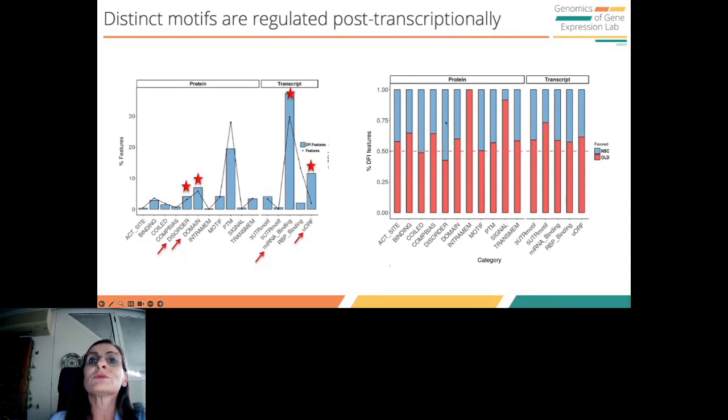And also what we can see is, if we evaluate the amount of functional content that we have as we transition from progenitor cells to oligodendrocytes, we see that in oligodendrocytes, so in the mature cell, we have in general a higher number of inclusions of functional elements than in the progenitor cell. So meaning that isoforms expressed in the differentiated cells have more functional load, more functional domains, for almost all databases.